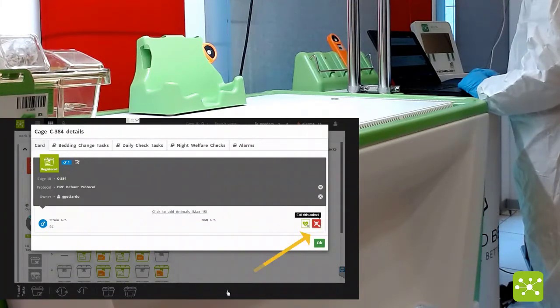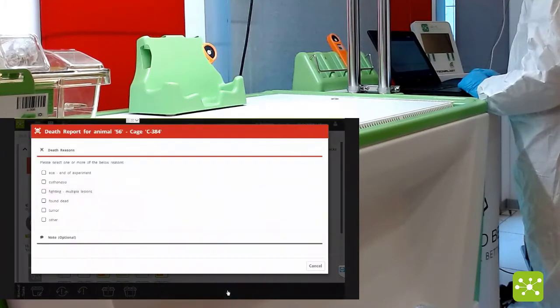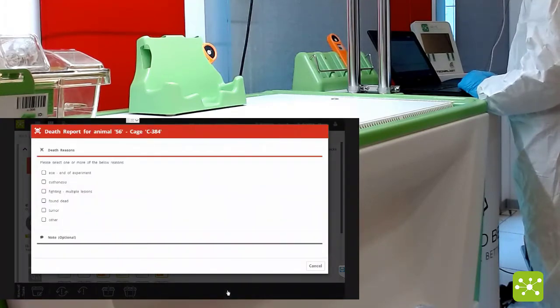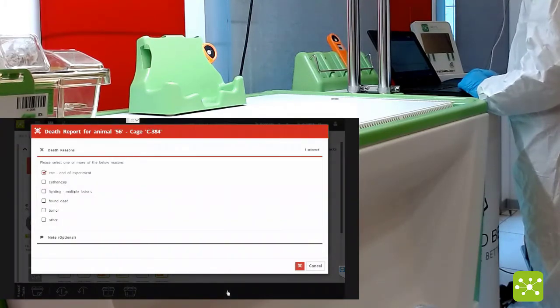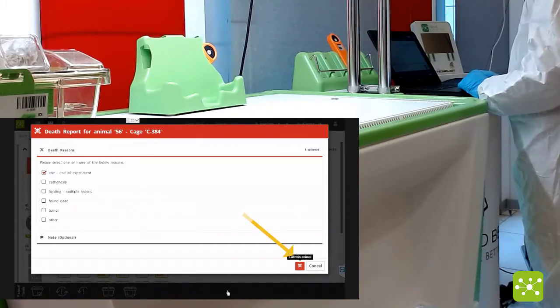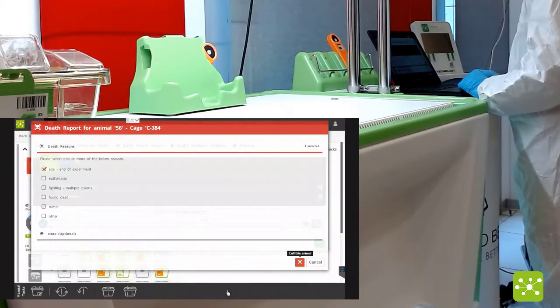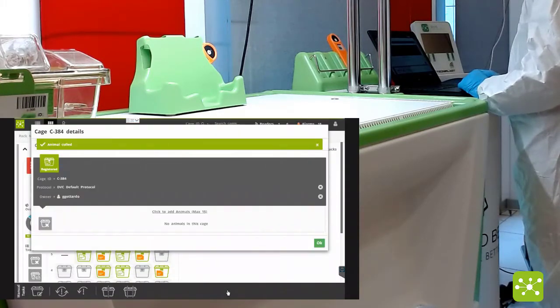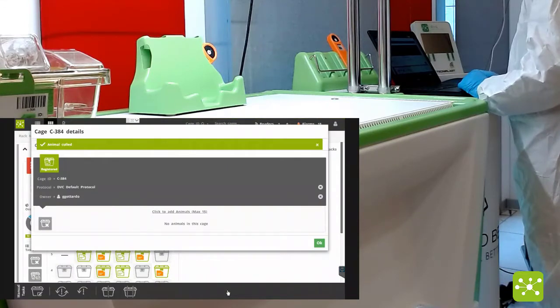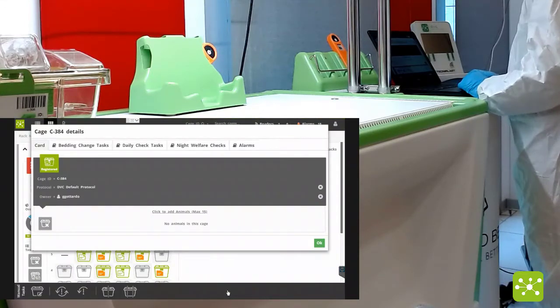Now selecting the animal you want to cull, clicking on the icon again, providing a valid reason for termination, clicking on the corresponding button.